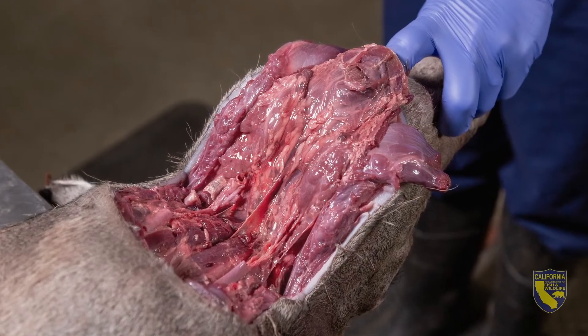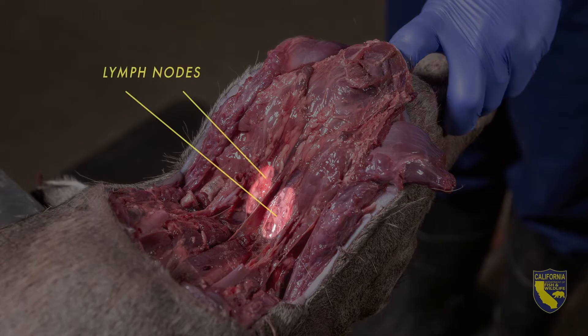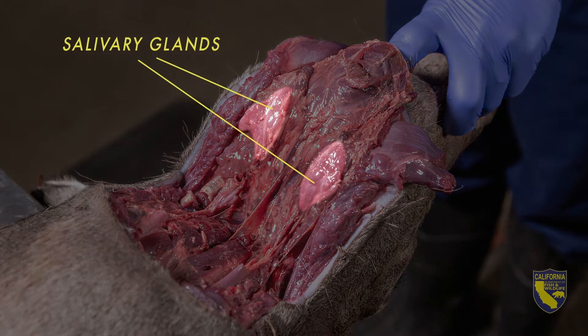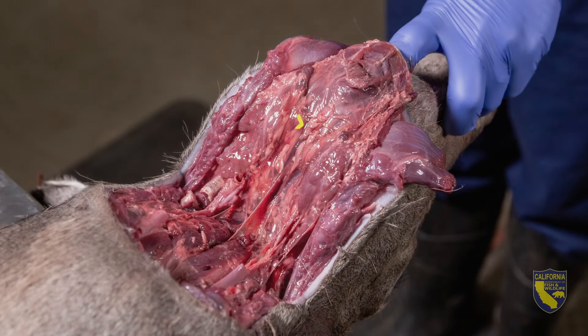Let's take a moment and identify what we're looking at here. The retropharyngeal lymph nodes are here, on either side of the midline. These are what we're looking for. There are other structures that could obscure or be mistaken for lymph nodes, including the salivary glands, muscle, and fat.